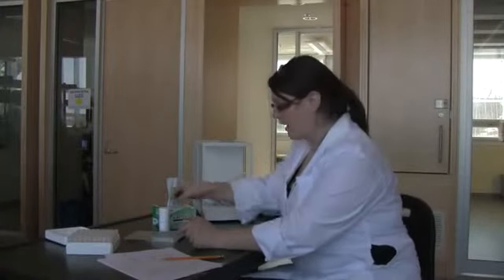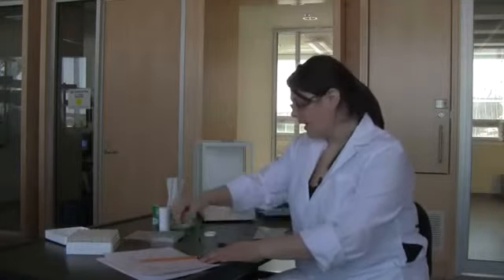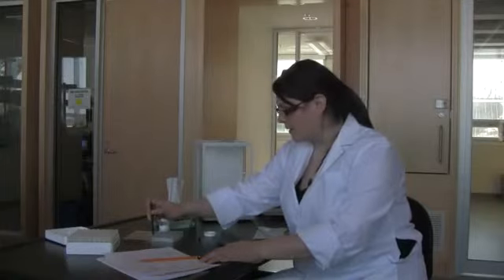Once flattened, the sample goes into the appropriate labeled spot in the submission tray, which is located on your sample form, where you record your sample ID and the weight of that sample. Here you use a flat probe pushing down the sample into the bottom of the tray.